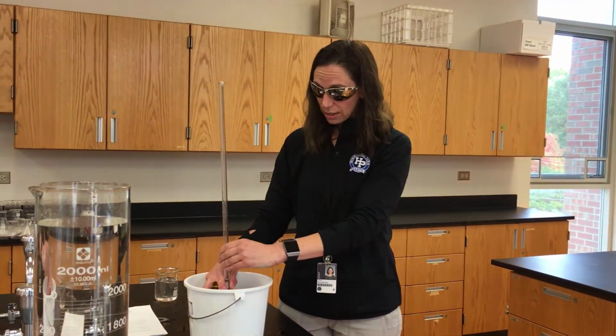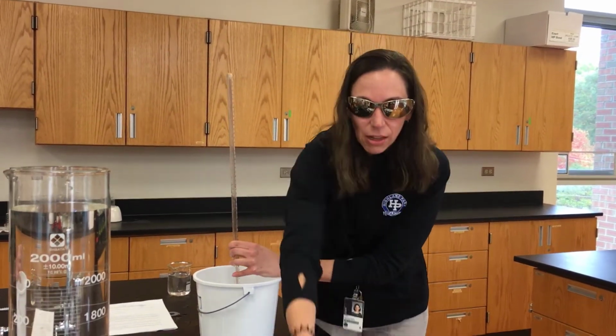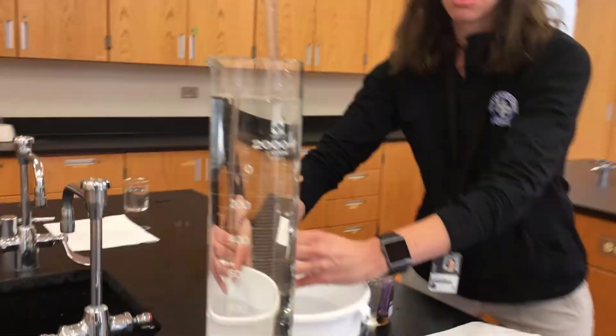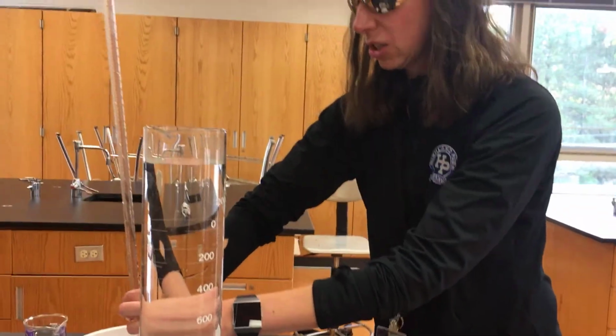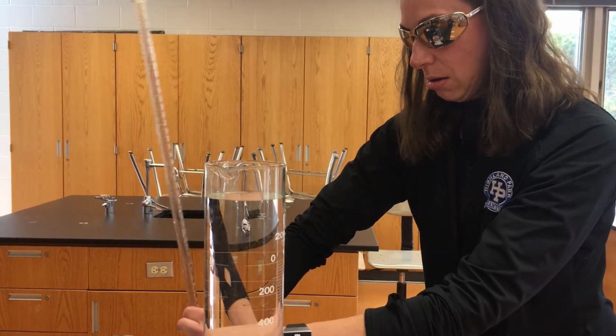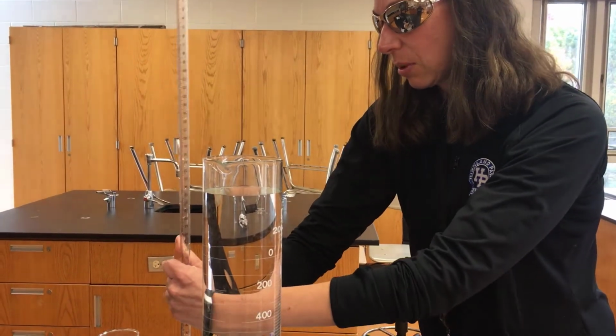Okay, so it took us a little while because it was slowing down a lot there, but now we have the lighter, which will dry off here in a second. I'm going to slide this closer to our, normally it would be a graduated cylinder, but something that's tall, so we can equalize the pressure in the room and the pressure inside our eudiometer by making the liquid levels the same.